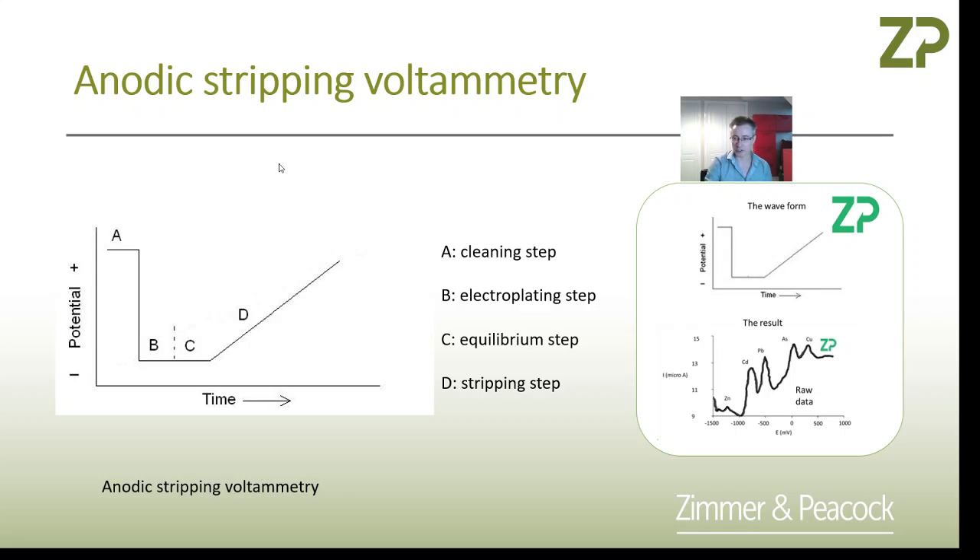The screen printed electrode sits in the potentiostat. First you apply a positive voltage — that's a cleaning step. Then you apply a negative voltage, which electroplates the ions out of the sample onto the electrode. Then you do an equilibrium step, followed by a linear sweep voltammetry from cathodic to anodic.